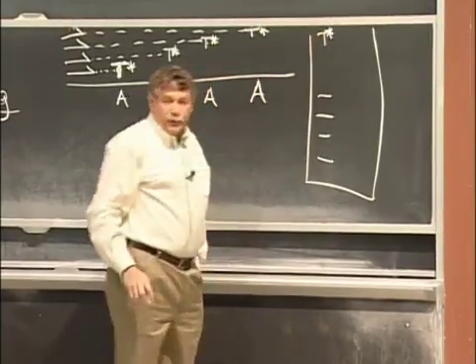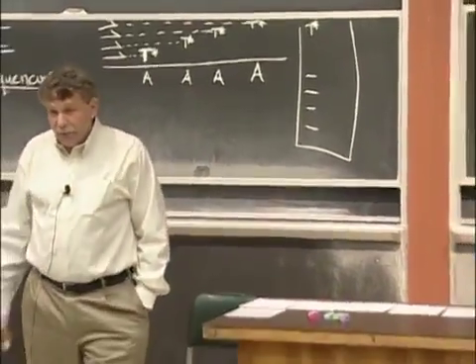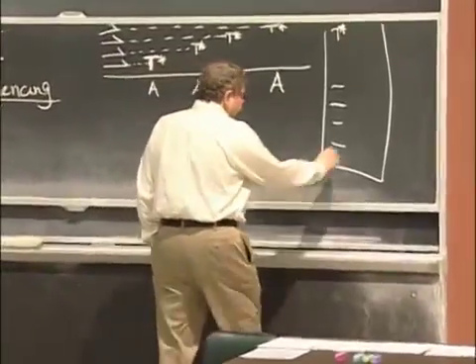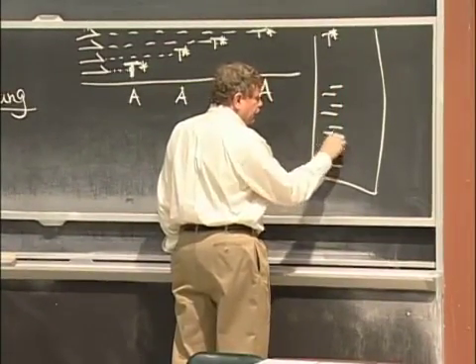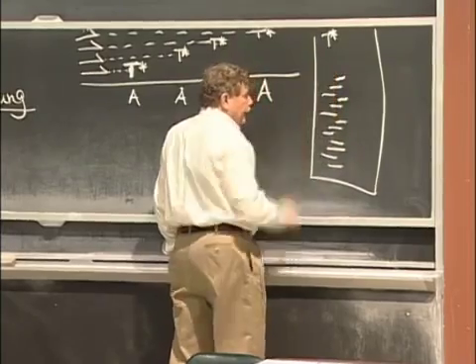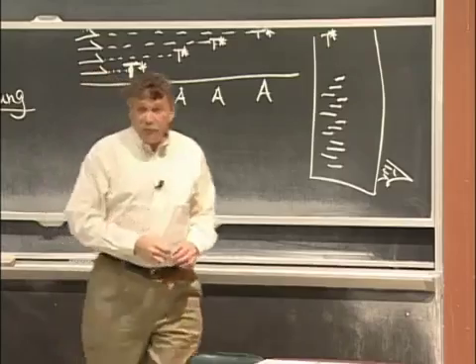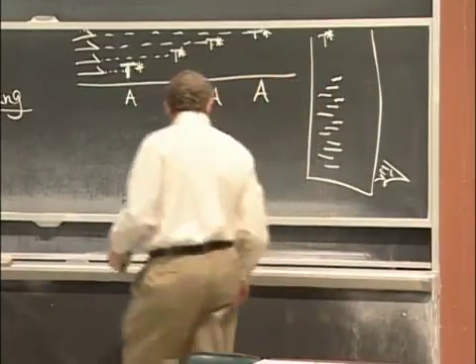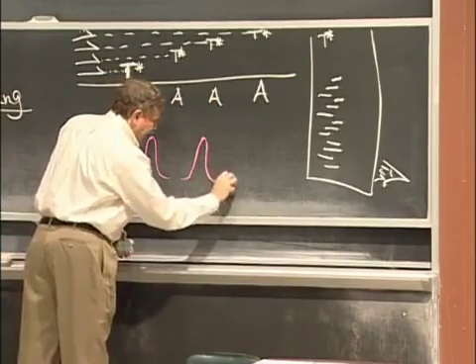If we attach a fluorescent dye, then those fragments are fluorescently labeled. We could all run them in the same lane with different colors. And we could put our little fluorescence detector and see what goes by. And the traces you would get, the actual pictures that emerge from this, look something like this.